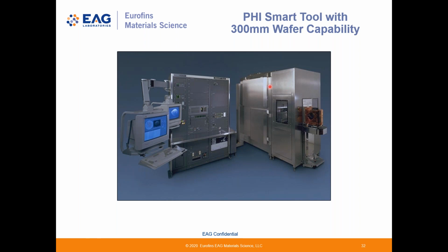The system has the same features that the earlier instrument I showed you has, except the vacuum chamber, of course, is much larger to accommodate the much larger samples. And we're hiding all the cool stuff within these steel enclosures to give it this nice, clean appearance.